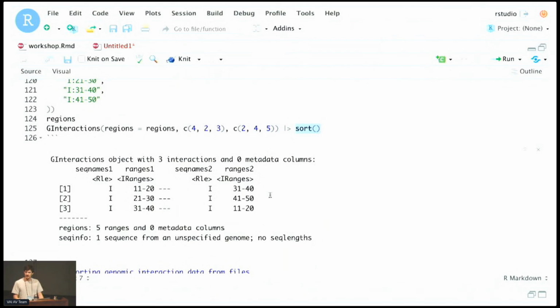It means something if you have a genomic range in anchor 1 or anchor 2. That's information you may want to retain, so in that case you wouldn't want to call sort. Exactly. I can either keep it as it is, or add a sort if I want to make sure that they follow the canonical orientation of pairs provided in other files.